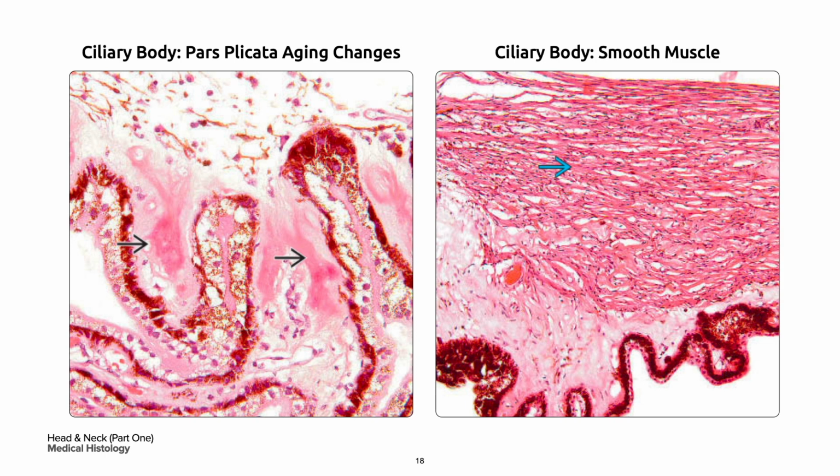On your right is the ciliary muscle, which is the smooth muscle in a bold single arrow that forms the bulk of the ciliary body. Although histologically difficult to distinguish, the 3 layers of muscle, the inner circular, middle oblique, and outer longitudinal, are present here. Contraction relaxes the zonular fibers, allowing the lens to change its shape.